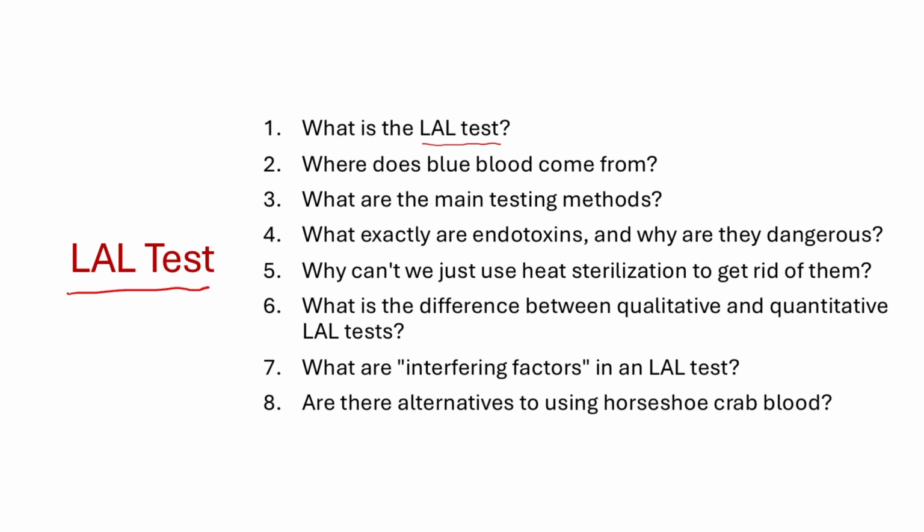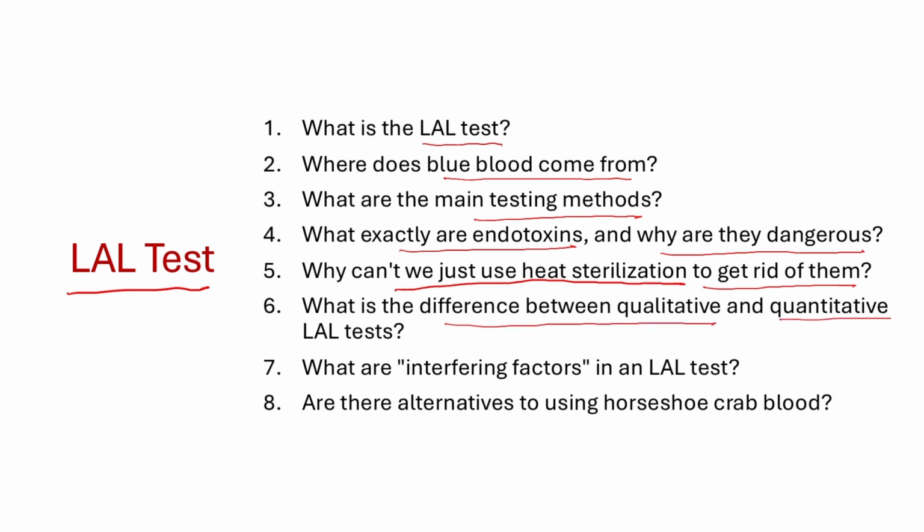So what is LAL test? Where does blue blood come from? What are the main testing methods? What exactly are endotoxins and why are they dangerous? Why can't we just use heat sterilization method to get rid of them? What is the difference between qualitative and quantitative LAL tests? What are the interfering factors and what are the alternative methods?